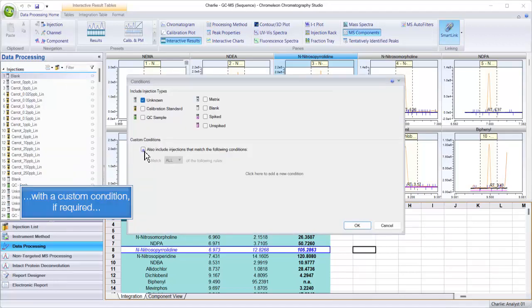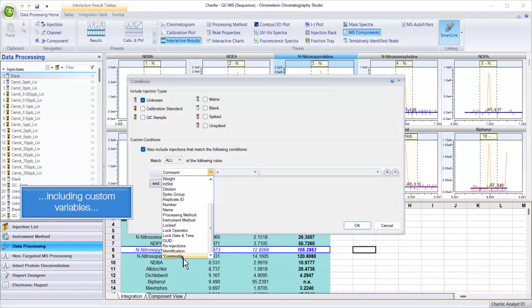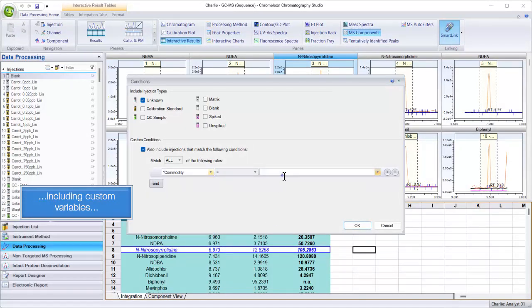With a custom condition, if required, including custom variables.